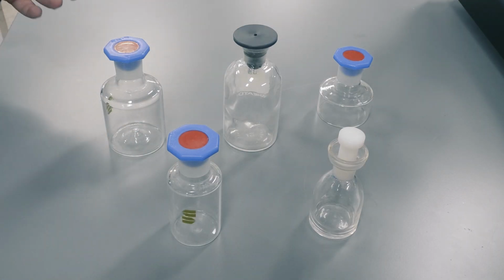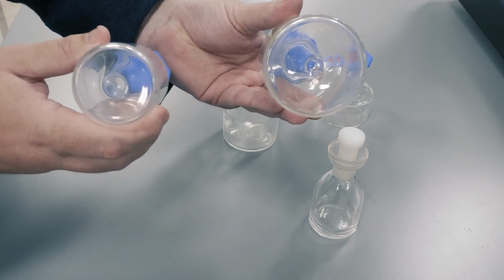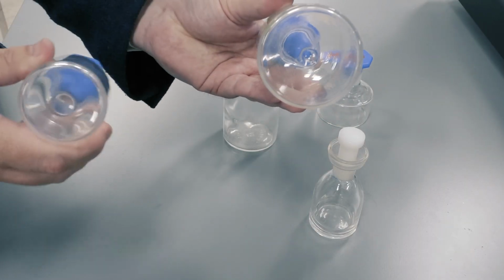So just a few examples here of the different bottles we have integrated, so a few different shapes and sizes, but what we're really looking at, so I mentioned footprint determining capacity. So if you see here, by going to a slightly smaller footprint bottle, so footprint in the tray, we would be able to go to a higher capacity per tray using these smaller bottles.